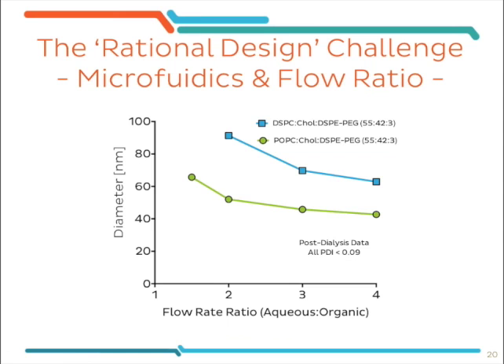So if I was making these liposome formulations in a beaker, I would actually get liposomes of one size with a relatively high polydispersity. But by controlling the liposome self-assembly through defined microfluidic mixing parameters, I can make liposomes of different sizes with low polydispersity. And so let's say I want to compare these two formulations in an in vivo model. Then I would want to compare vesicles of the same size.